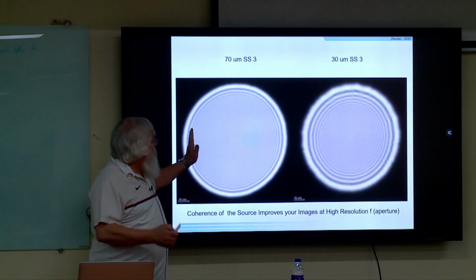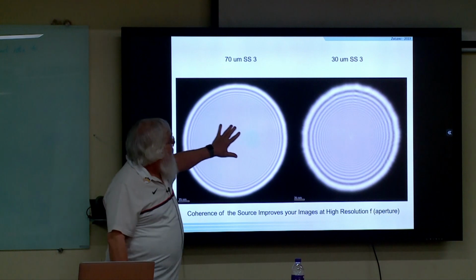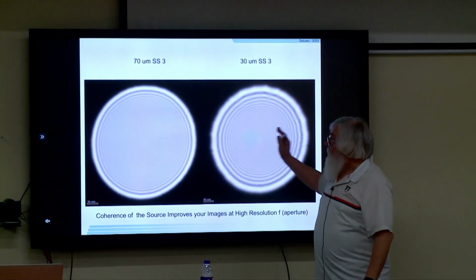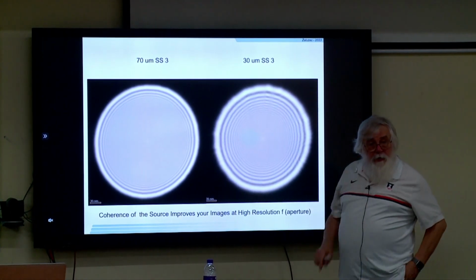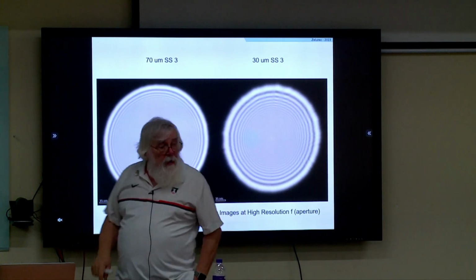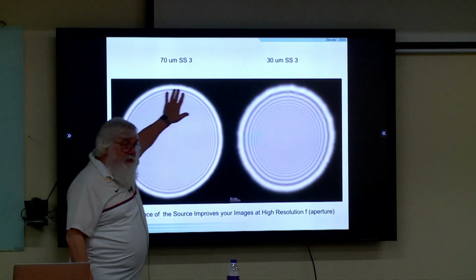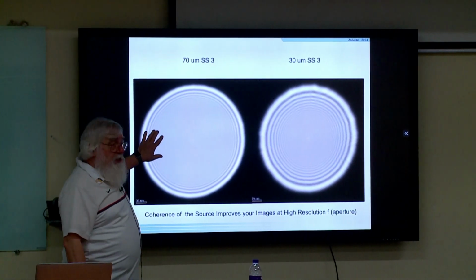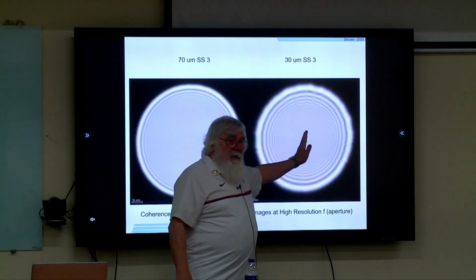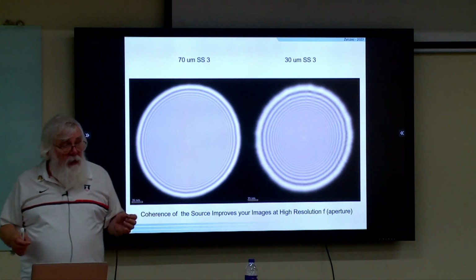So here's a large aperture, 70 microns, relatively large. And here's a small aperture, 30 microns. What's happened? The size of the probe has gotten smaller. Also, very importantly, this happens to be a field emission gun instrument. And if you look very closely at the image of the probe, there's no sample in the way here. This is just the beam going through vacuum. We see fringes. Those fringes are Fresnel fringes. We'll talk about Fresnel fringes a little bit later.